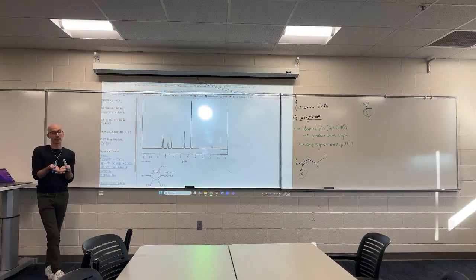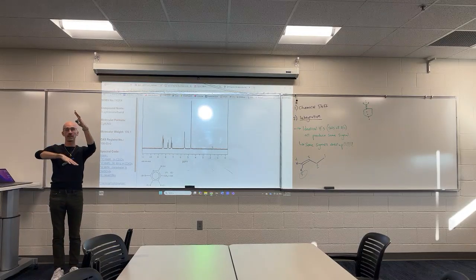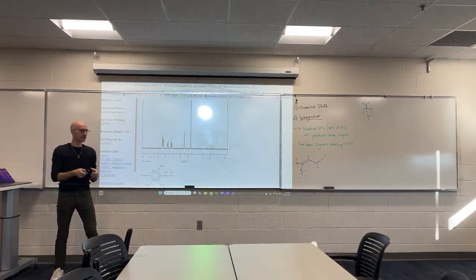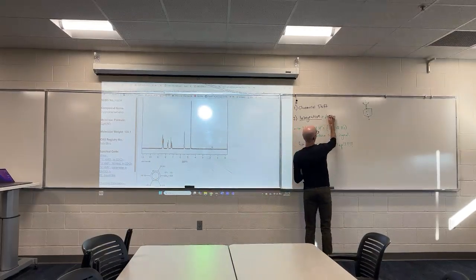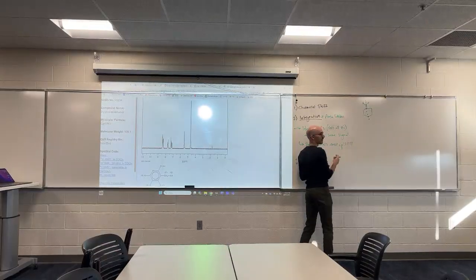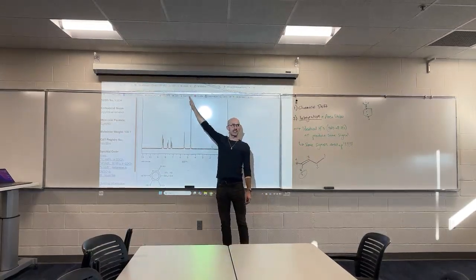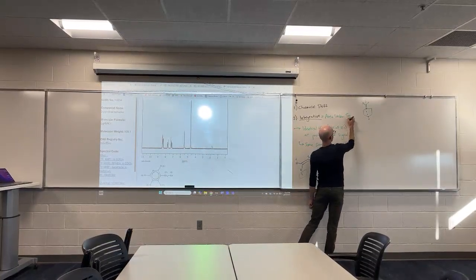And this actually relates to its mathematical term. Integration is to take everything that's underneath a curve and report that area as one sum. Integration is the area under the curve. In this case, our curve is our signal. So we're saying area under the signal.